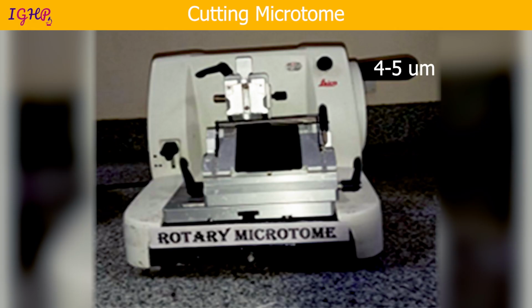Now this is the third member of the family of Mr. M, and he is Mr. Cutting Microtome. Again, a very important machine that we use in the histopathology department. In this, the molds that we have formed in the embedding machine are cut by putting the blocks in the block holder.